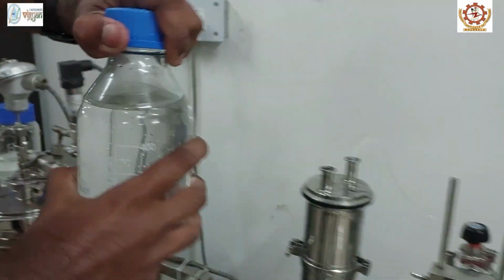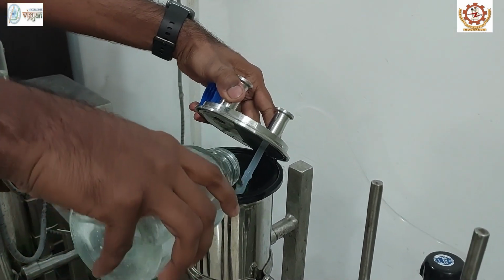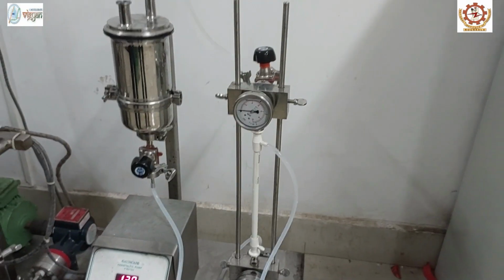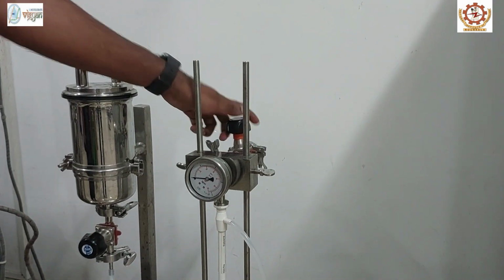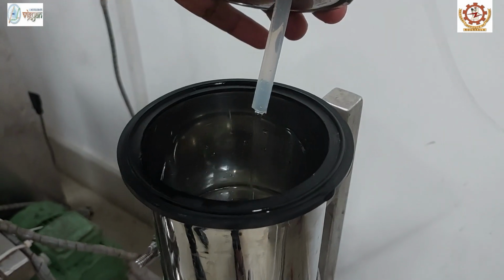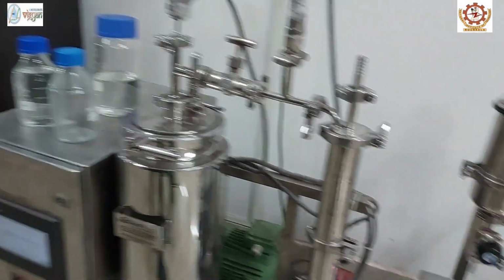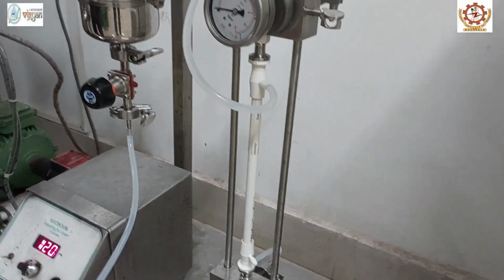For this, we will add 500 ml of NaOH solution into the feed tank and switch on the peristaltic pump. Here also, make sure that the inlet valve is open and there is no transmembrane pressure. You can see there will not be any filtration happening. The complete alkali solution will be recirculating back. Once the alkali wash is over, we will be collecting the NaOH solution back into this conical flask.